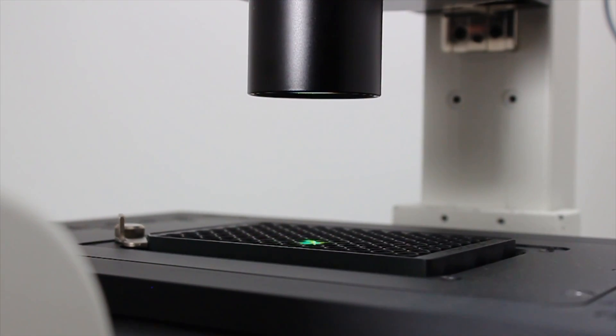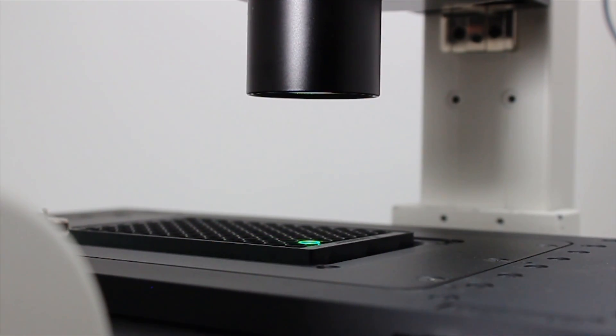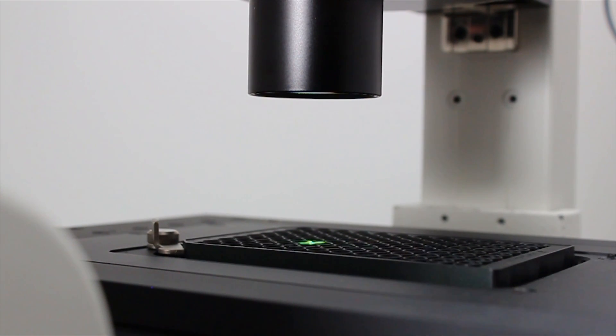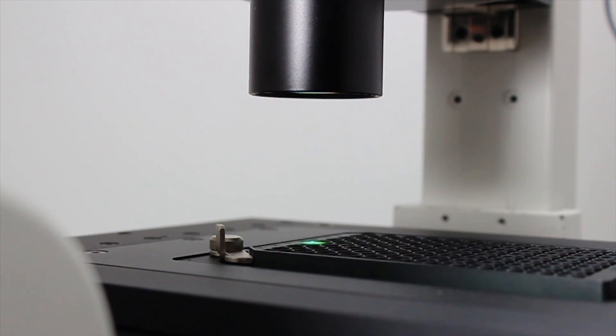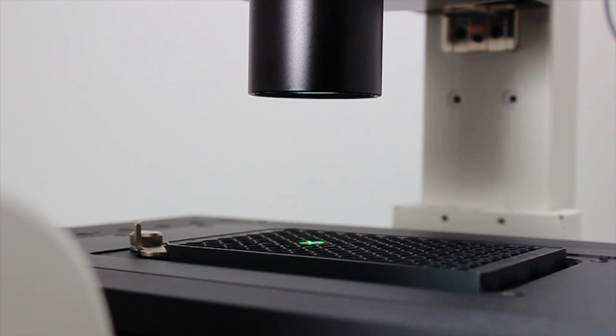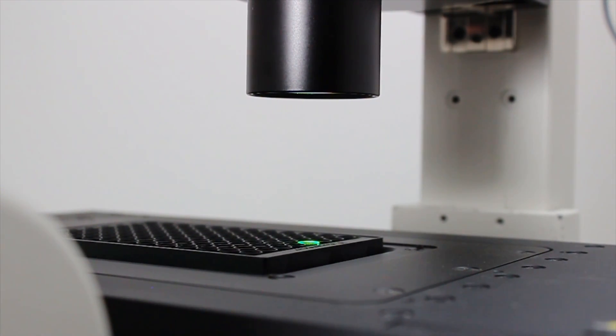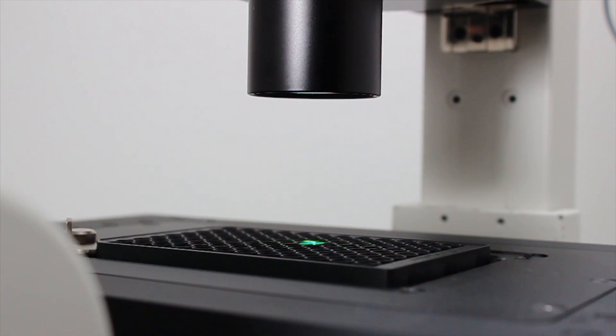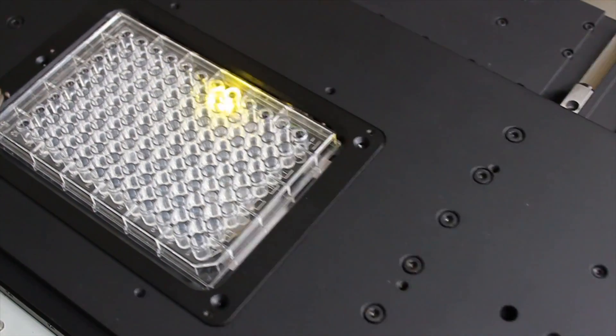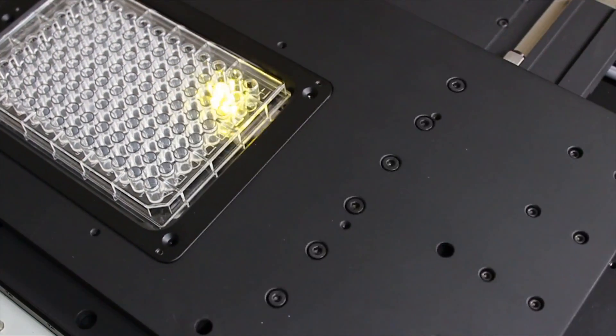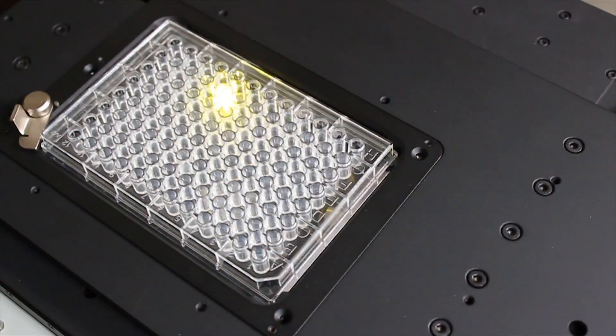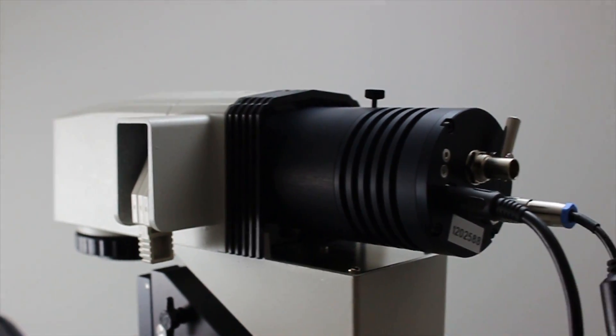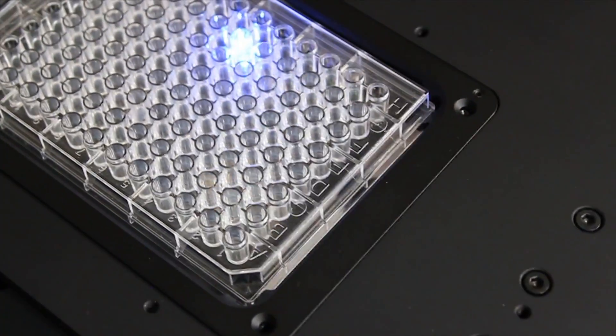High speeds, extreme precision, TTL triggering solutions, velocity controls. These are all necessary to blend performance with integration. Prior scientific DC linear motor stages deliver on all of these specifications.